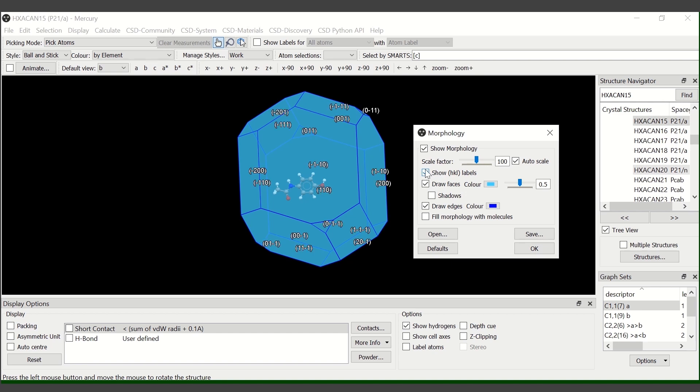You have the option to visualize how molecules are arranged within the crystal and to see which functional groups are exposed from each phase. To do so, tick the fill morphology with molecules option.